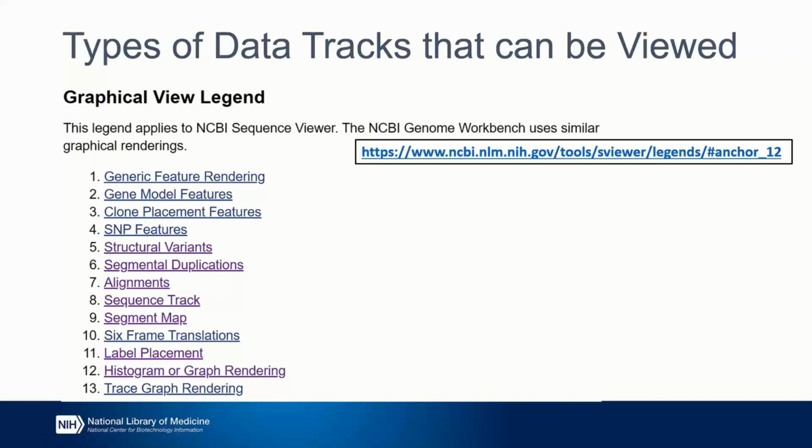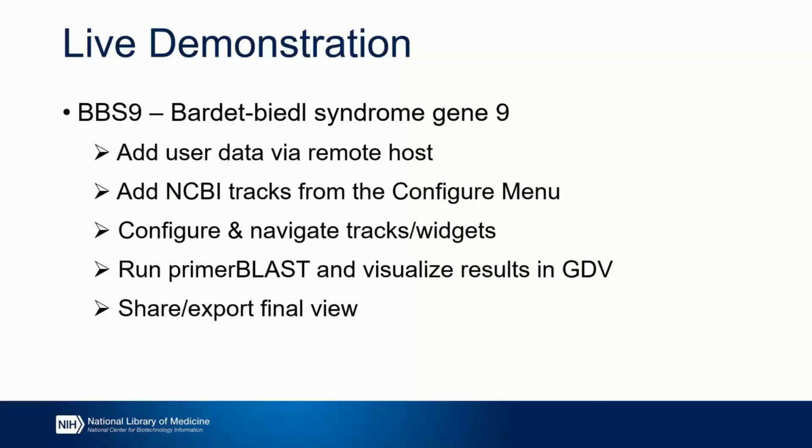Now, in the upcoming demo, I will be mentioning a few of these different tracks, but I just want to emphasize that between the different file formats that are available and the different types of tracks, hopefully you can appreciate that there are just a lot of different types of data that you can visualize all at once using these genome browsers. So now we're going to move on to the live demonstration for today.